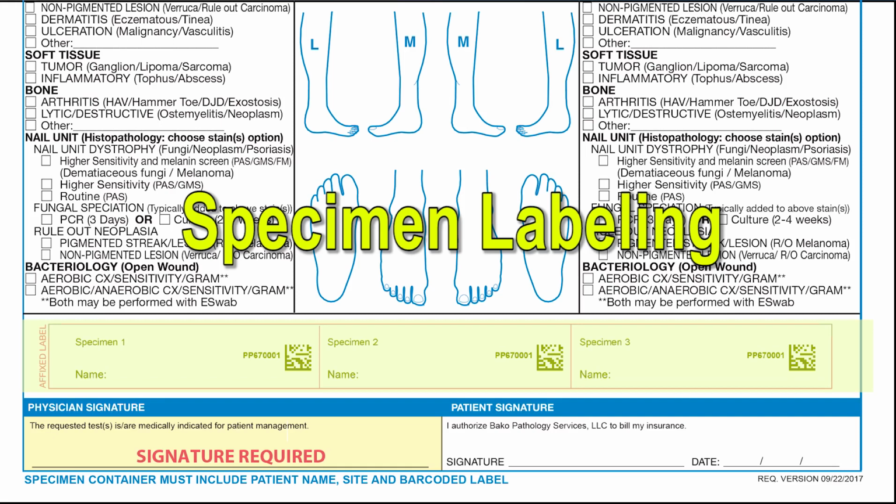The label reminds you to place the name of the patient on the label. Please also write the site of the specimen placed in the container. Please be specific. Please add the date of birth of the patient to further ensure the identification of the patient. Finally, to make all the above valid, the requesting physician must sign the requisition.